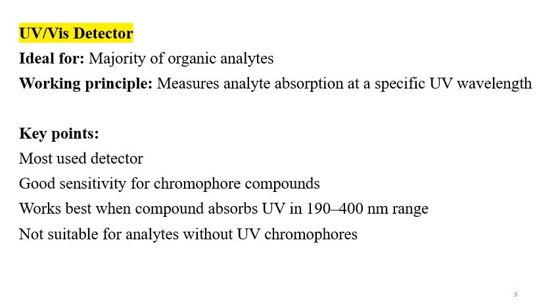The UV visible detector, or UV detector, is used for the majority of organic analysis, and it measures the analyte absorption at a specific UV wavelength. For this we need to have the lambda max.